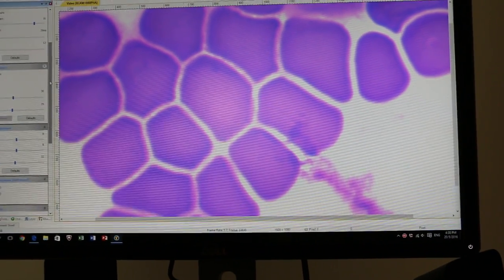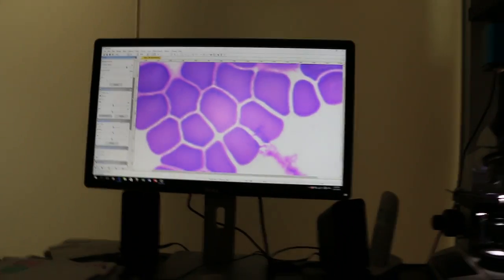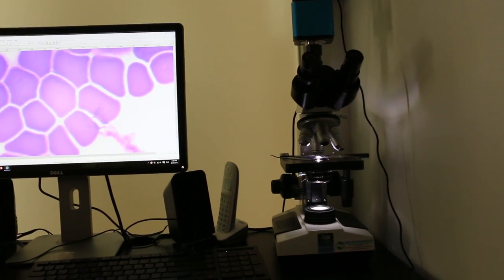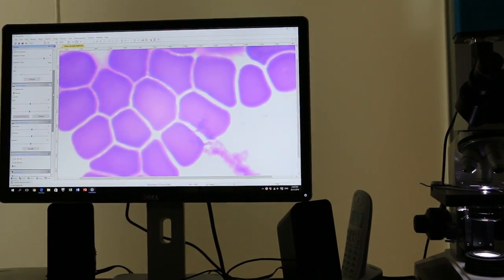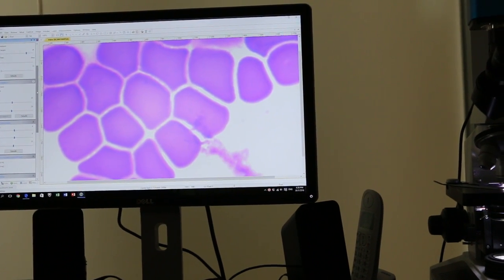Queen's Vet, May 20th, 2016. Viewing, checking for Babesia in peripheral blood smear in dogs with anemia and thrombocytopenia. May 20th, 2016, Singapore.